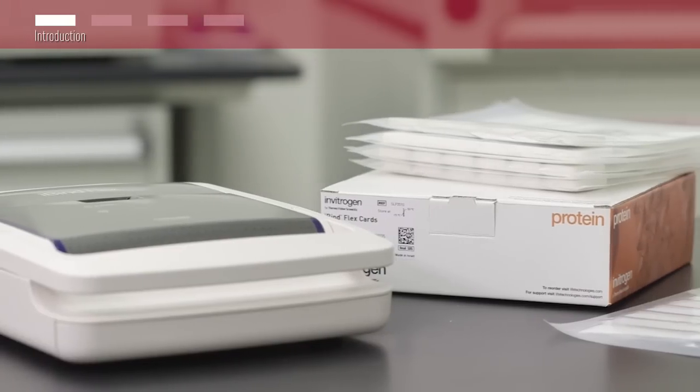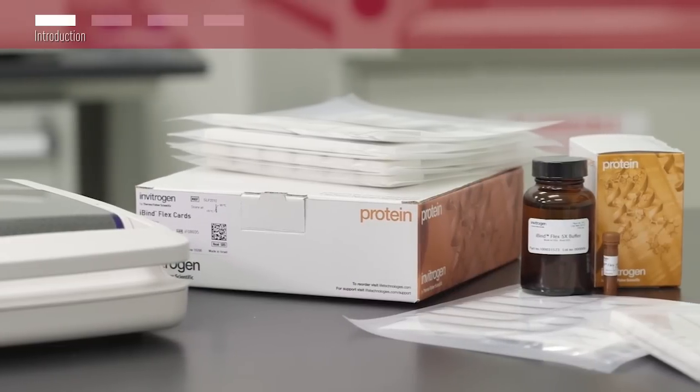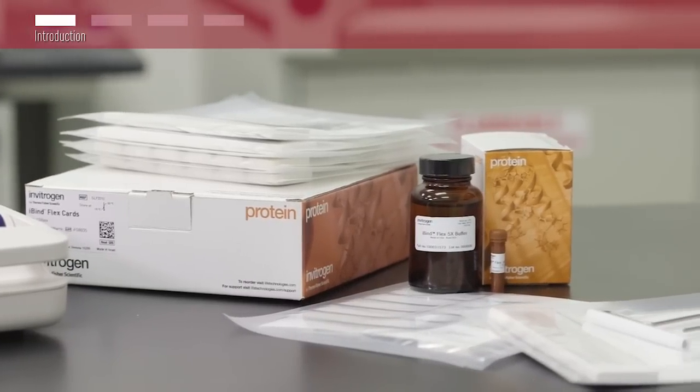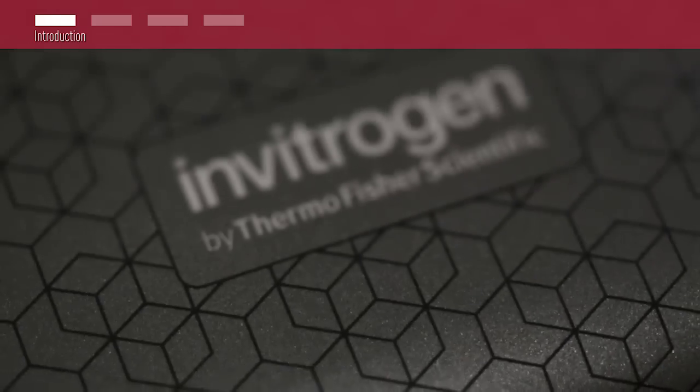Utilizing sequential lateral flow technology, the iBind Flex Western system automates the painful manual steps of antibody incubation and subsequent washing of your blot in a setup and walk away solution without the need for electricity.